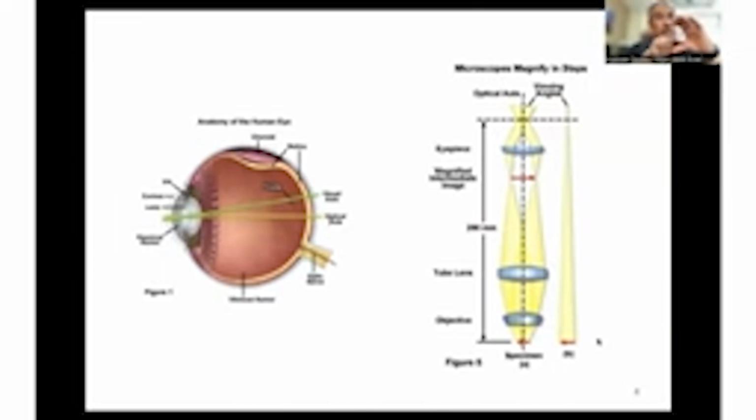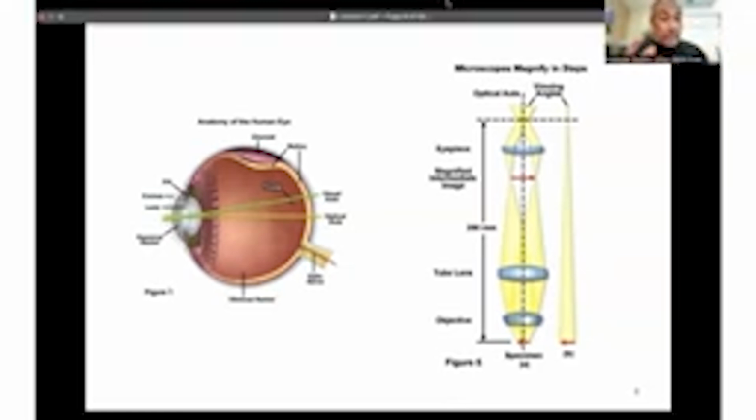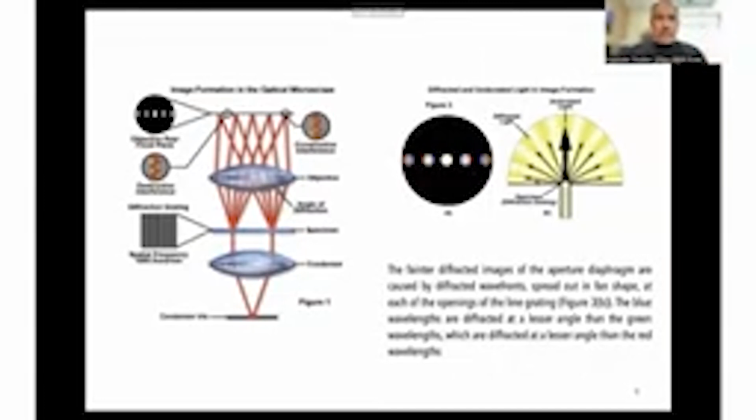And now this allows you to visualize things, right? There are many of us who might be color blind and are not able to distinctly separate out colors, right? And there are many other changes that could happen, which means for the eye to be able to perceive something, all this machinery has to work properly, okay, to be able to allow you to visualize something. And that's the same with microscopes as well, right?